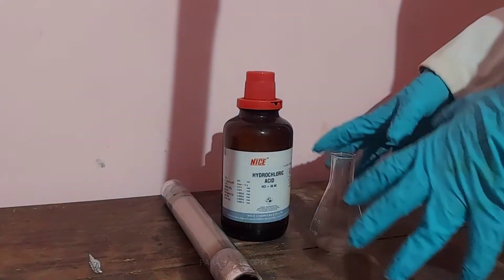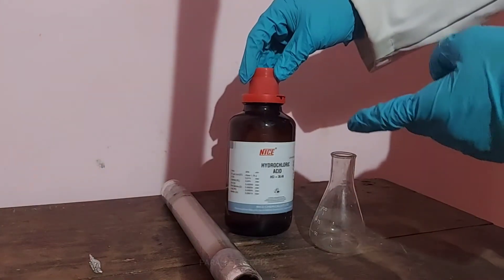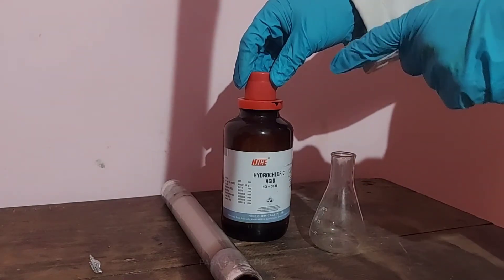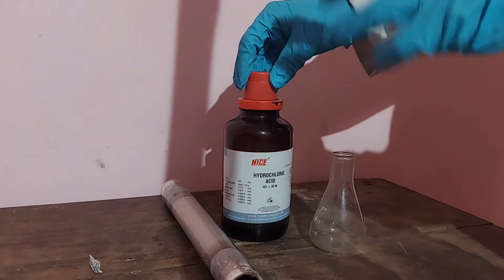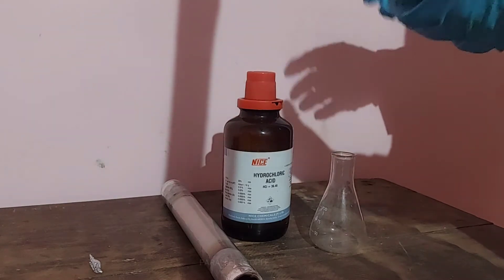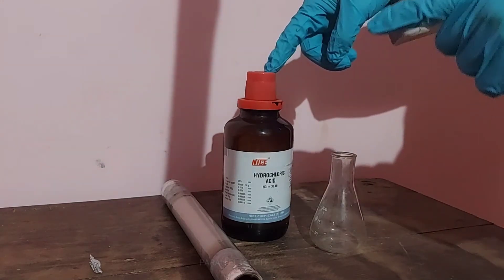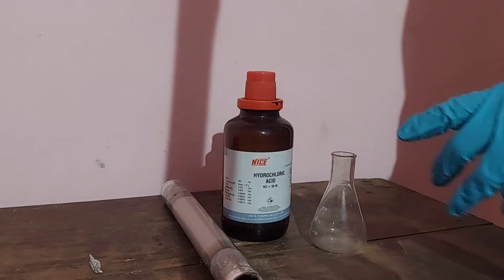Hi friends, welcome to Parallel People channel. Today we are going to do the Dancing Flame experiment. For this experiment we just need hydrochloric acid, aluminium foil, copper sulphate, and a container. We can use a conical flask, a round bottom flask, or a heat-resistant glass bottle. Bigger the container, better will be the display. Right now I only have this conical flask since I am at home, but you can use a bigger container for better results.